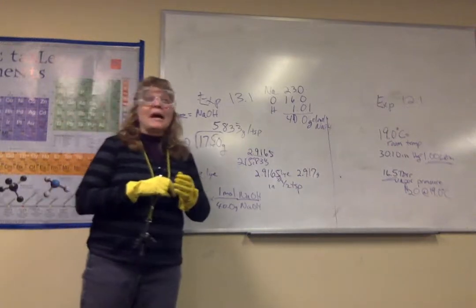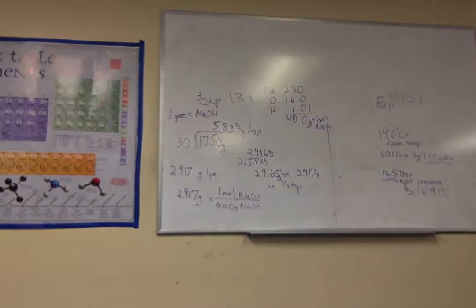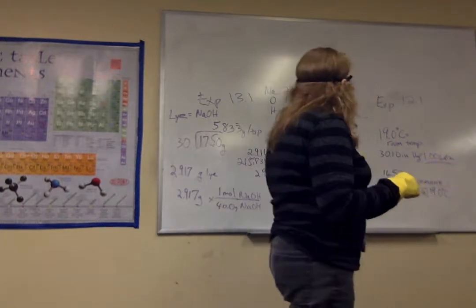This is grams of lye. It's the nasty stuff over here, which is why I'm doing it myself. Other people do it, but we're behind the lab anyway. That's this green stuff here. That's the stuff that causes a really bad fume. So we're only going to have one bad fume rather than the whole room, unless you go outside with it. It's a little cold, like 30 degrees outside, 32 or 35, whatever.